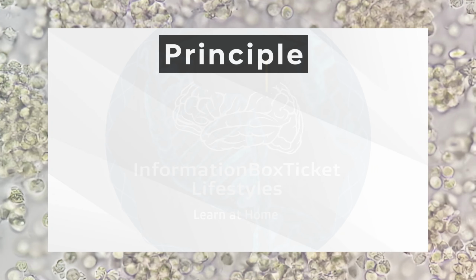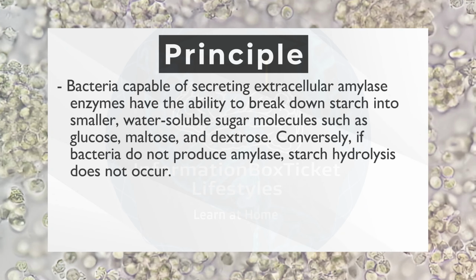Principle of Starch Hydrolysis Test. Bacteria capable of secreting extracellular amylase enzymes have the ability to break down starch into smaller, water-soluble sugar molecules, such as glucose, maltose, and dextrose. Conversely, if bacteria do not produce amylase, starch hydrolysis does not occur.